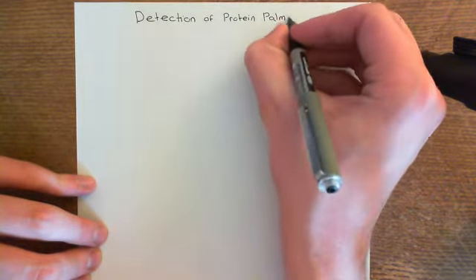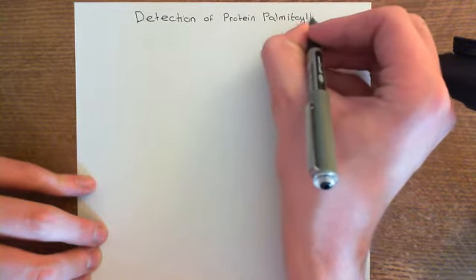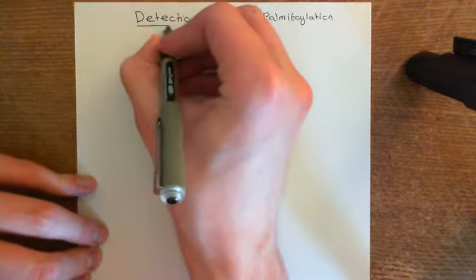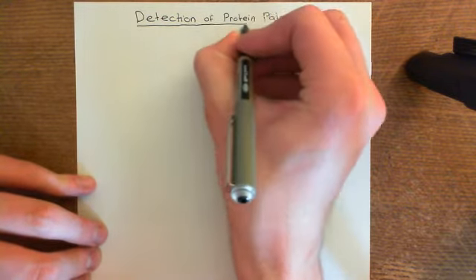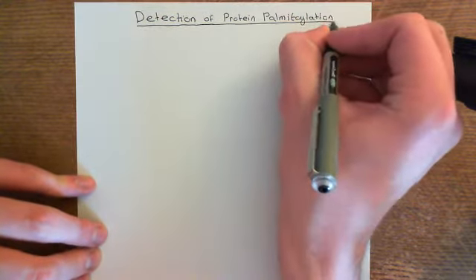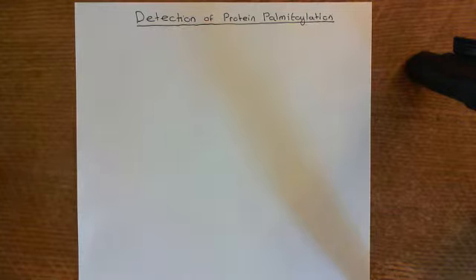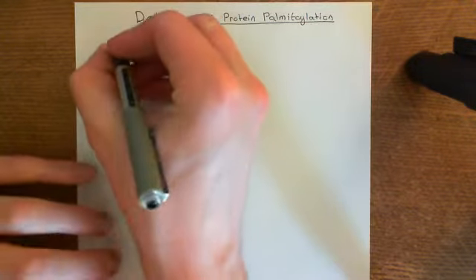So the structure for this video: we're going to start with a discussion of tritium and its radioactive properties. We're then going to move on to the methods by which you can actually use tritiated palmitic acid to detect the palmitoylation of your favourite palmitoylated protein. Right, let's start by discussing tritium then.